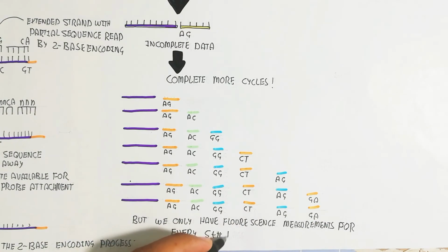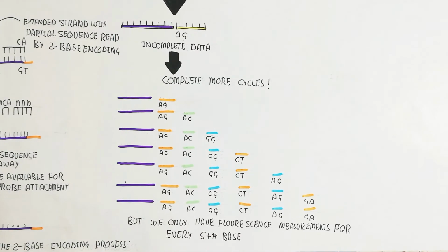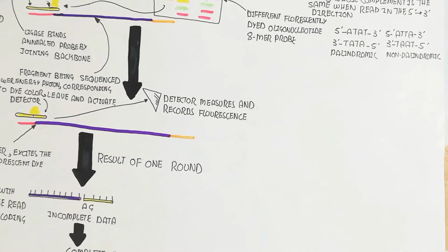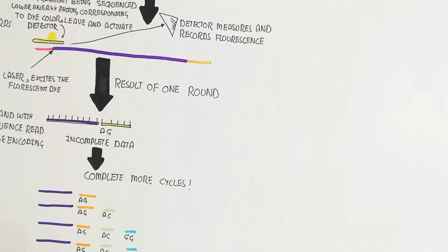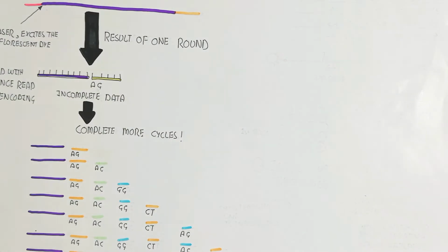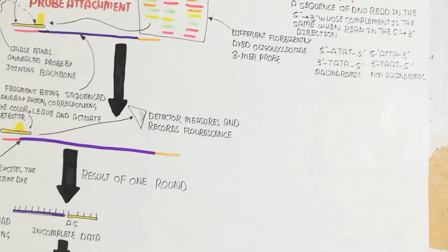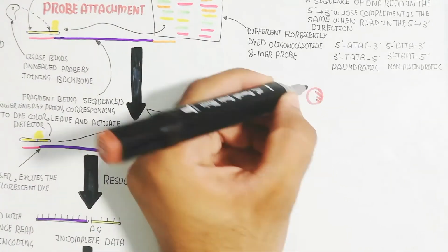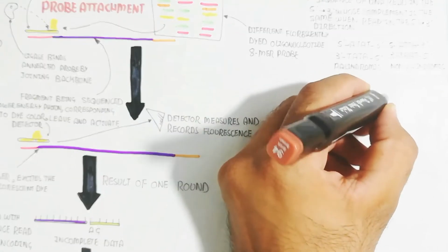The dye-labeled, two-nucleotide-containing segments produce color after the probe binding, because it is a probe. So remember, the probe will be separated, and the two-nucleotide-containing segment will produce color. And let's begin to understand the data analysis.